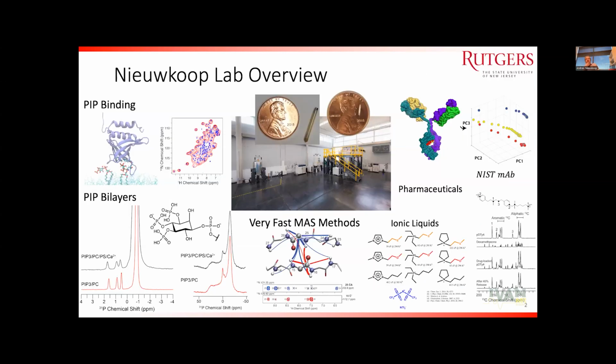Today, I'm going to talk about biological solid-state NMR. First, I wanted to introduce myself just a little bit, because I'm going to talk about a lot of things. It's not one big story. It's a bunch of little stories. So I just wanted to make it clear what I normally do. My main project in the lab is a membrane binding project, where we're studying proteins interacting with specific phospholipid. I'll show you a little data there in the section where I talk about membranes.